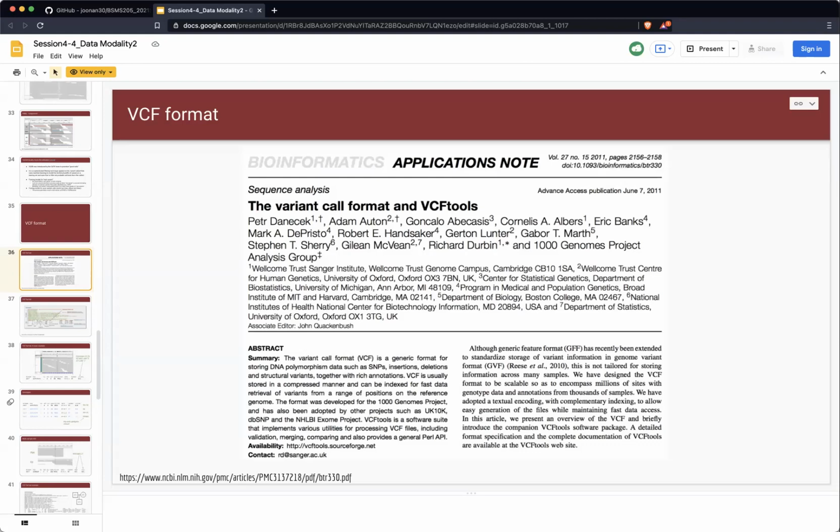So we use a very specific format called VCF, shortly for variant call format. The motivation for using this VCF file is the same as when we developed the SAM format. People wanted to develop a certain format to represent the variants or the genotypes we get from the samples, right? So people had to come up with a certain standard to look up variants from large data sets. VCF is the one they came up with as a solution at first.